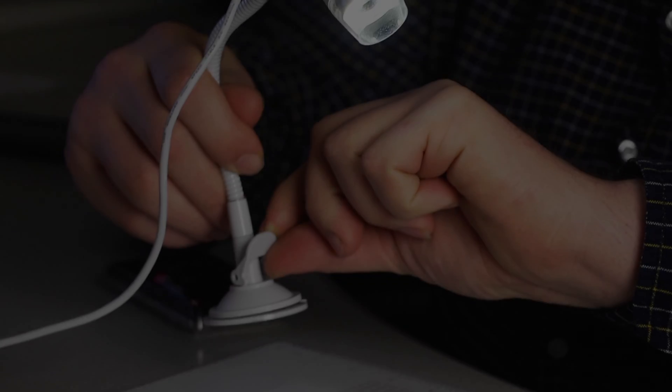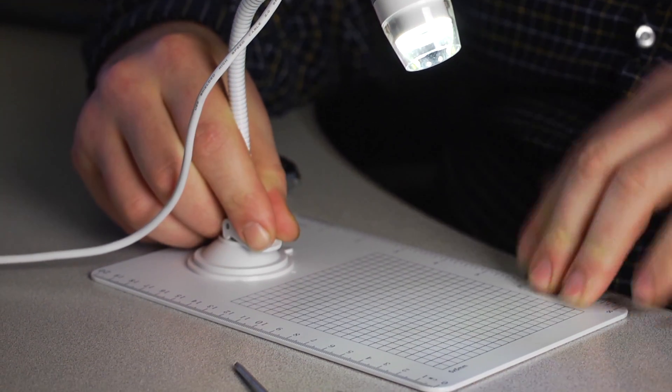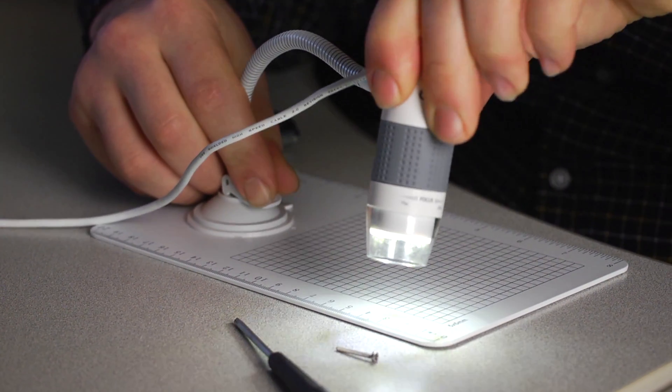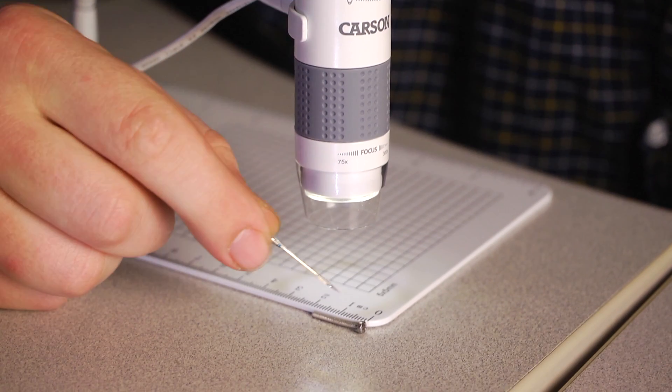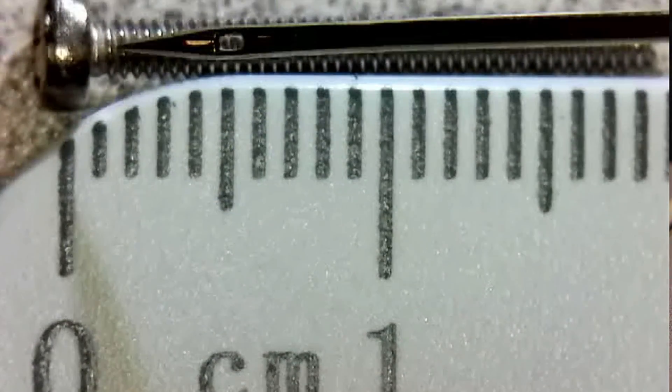The suction cup at the bottom can clamp down onto many smooth surfaces but works really well with the included base. With this you instantly have yourself a complete observing and measuring station.